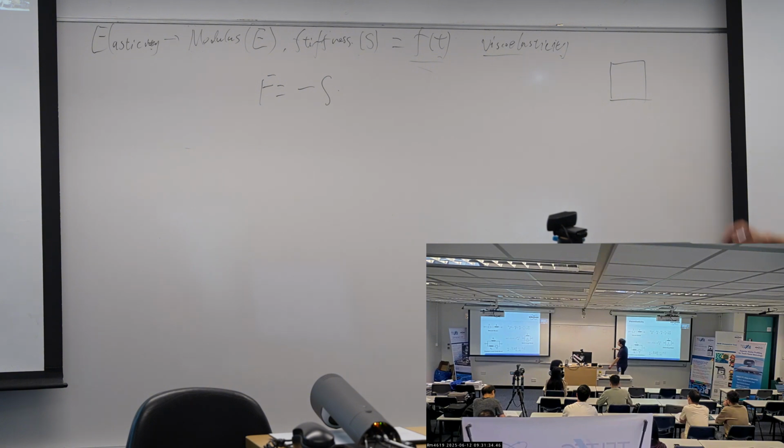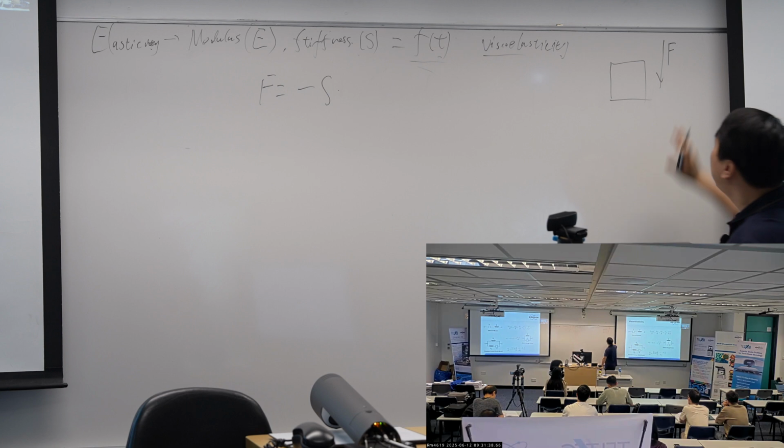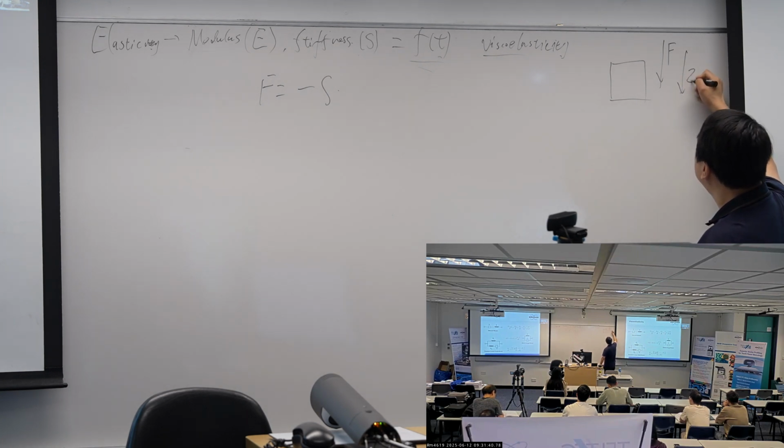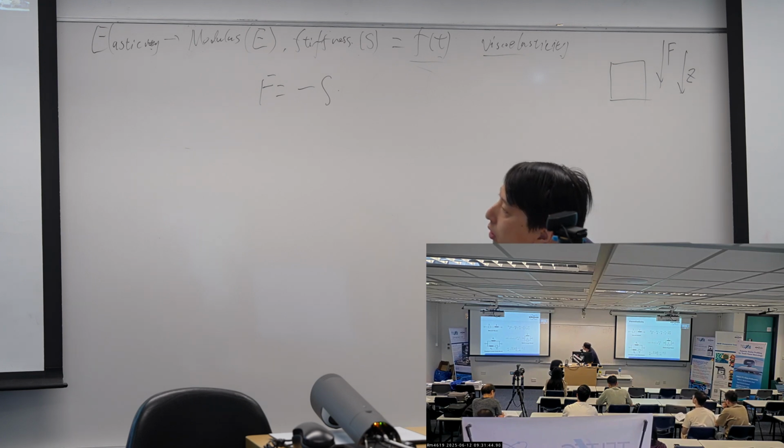We apply the force in this direction, which we call the Z direction.